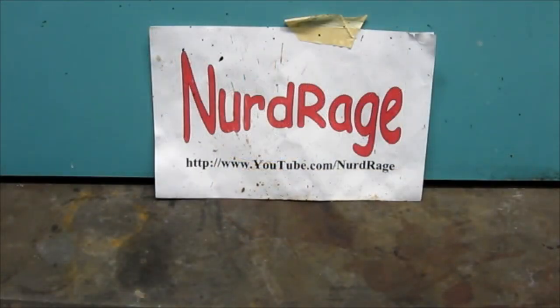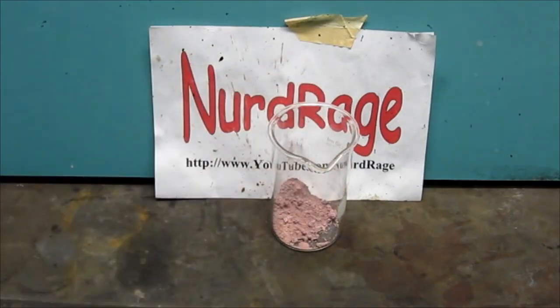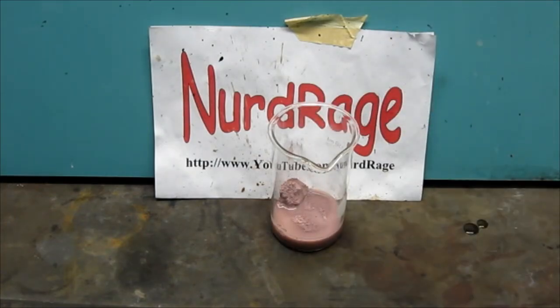Making cobalt nitrate is fairly easy. Just get a quantity of cobalt carbonate from a pottery supply store. Here I have about 10 grams. Add about twice its weight in water — in this case, 20 milliliters.